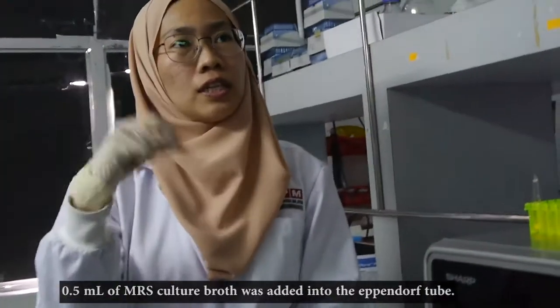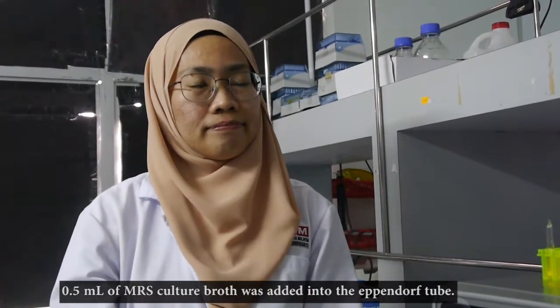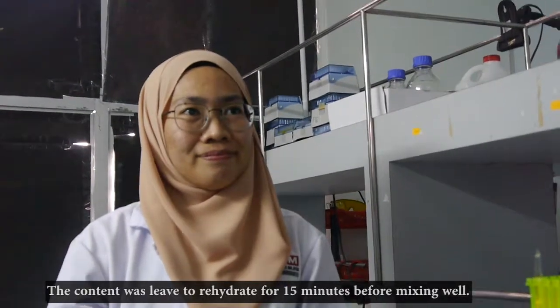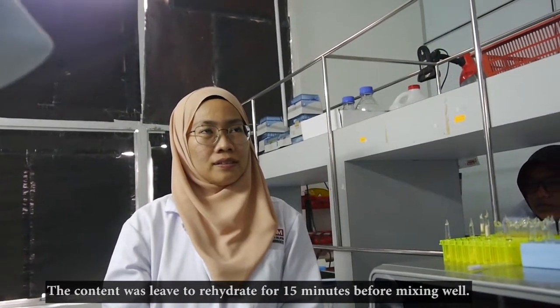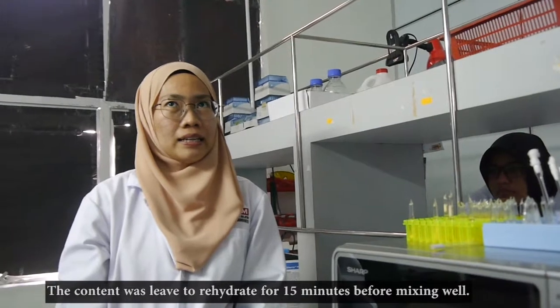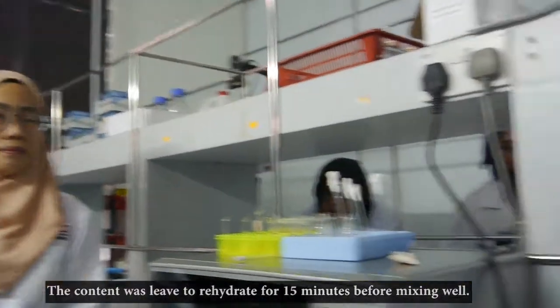Take the culture for streaking or just for CFU count, right? So for the dilution also, 100 microliter. Okay, continue for dilution, maybe 100 microliter, right? Into the 1 ml. Yes. Okay. Understand? Yeah, because in there you got 200 microliter, right?